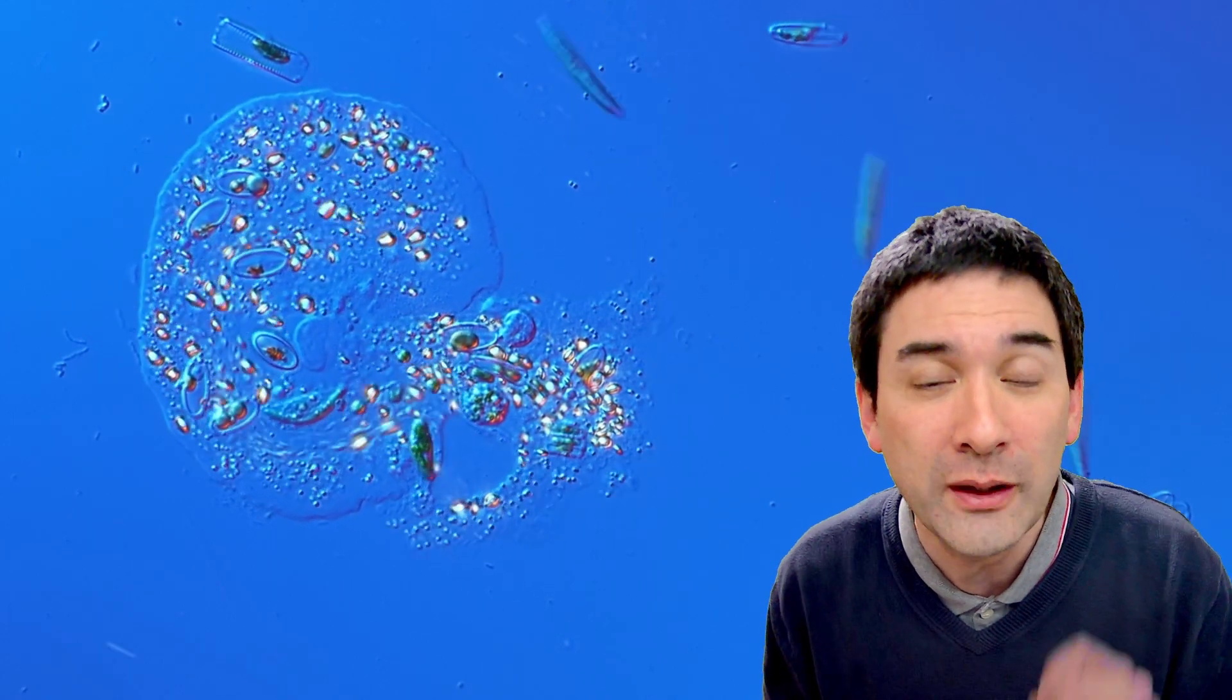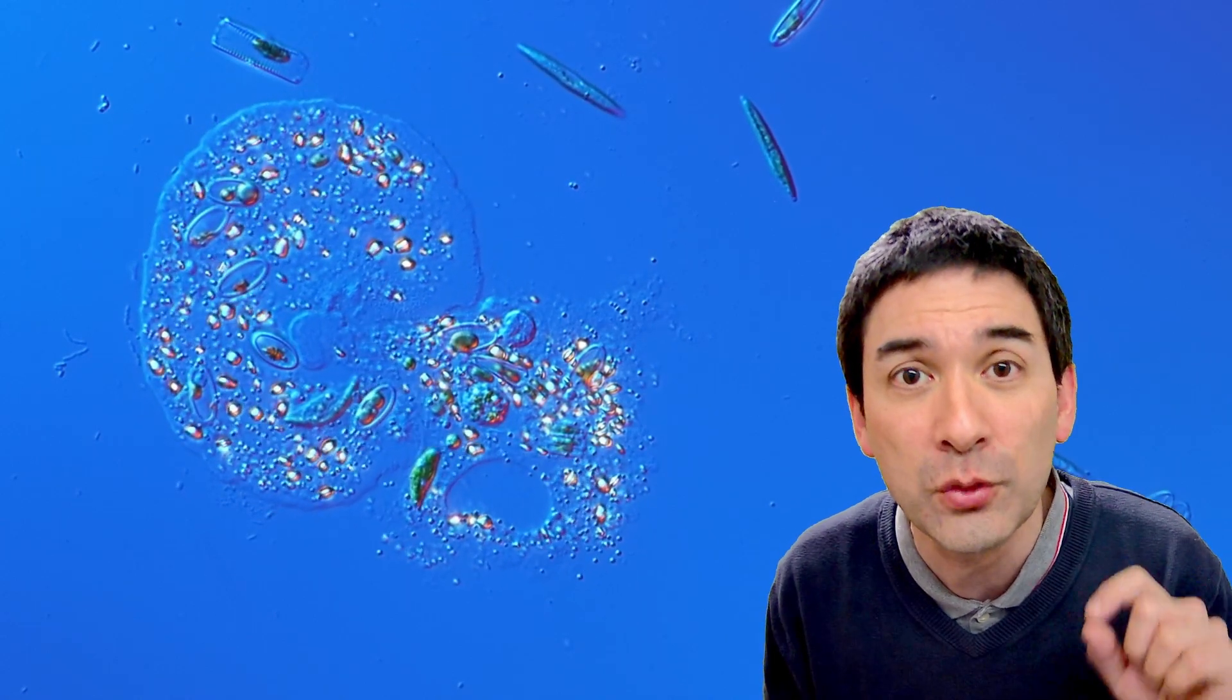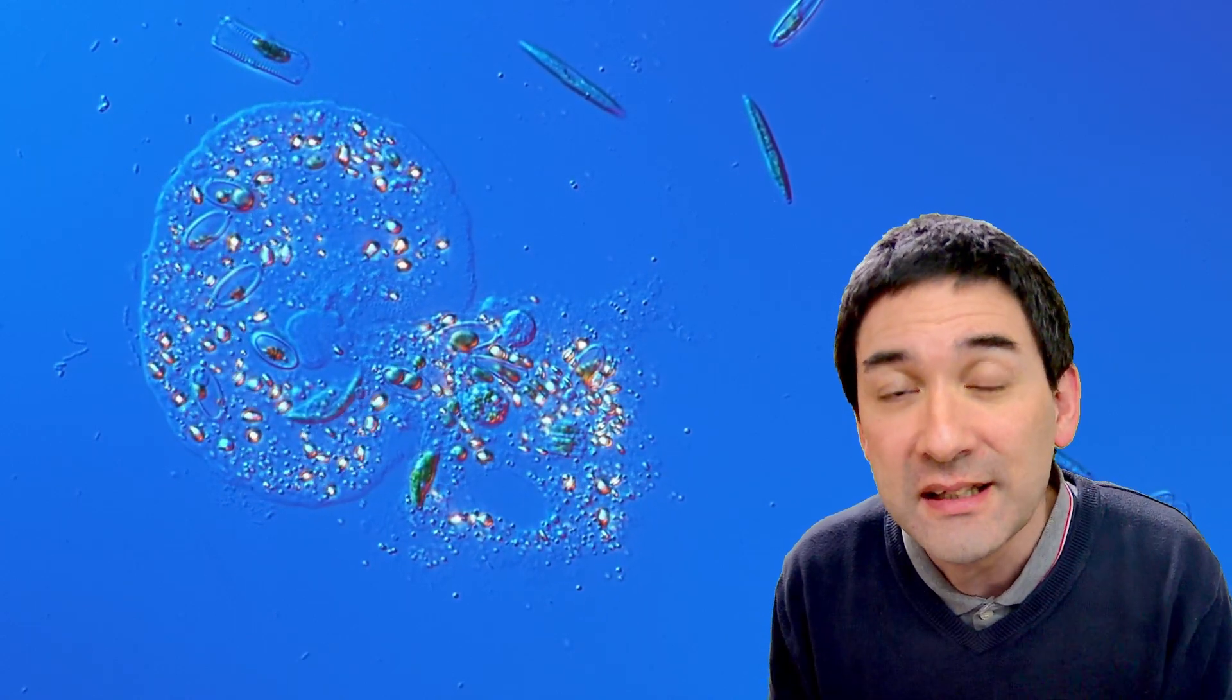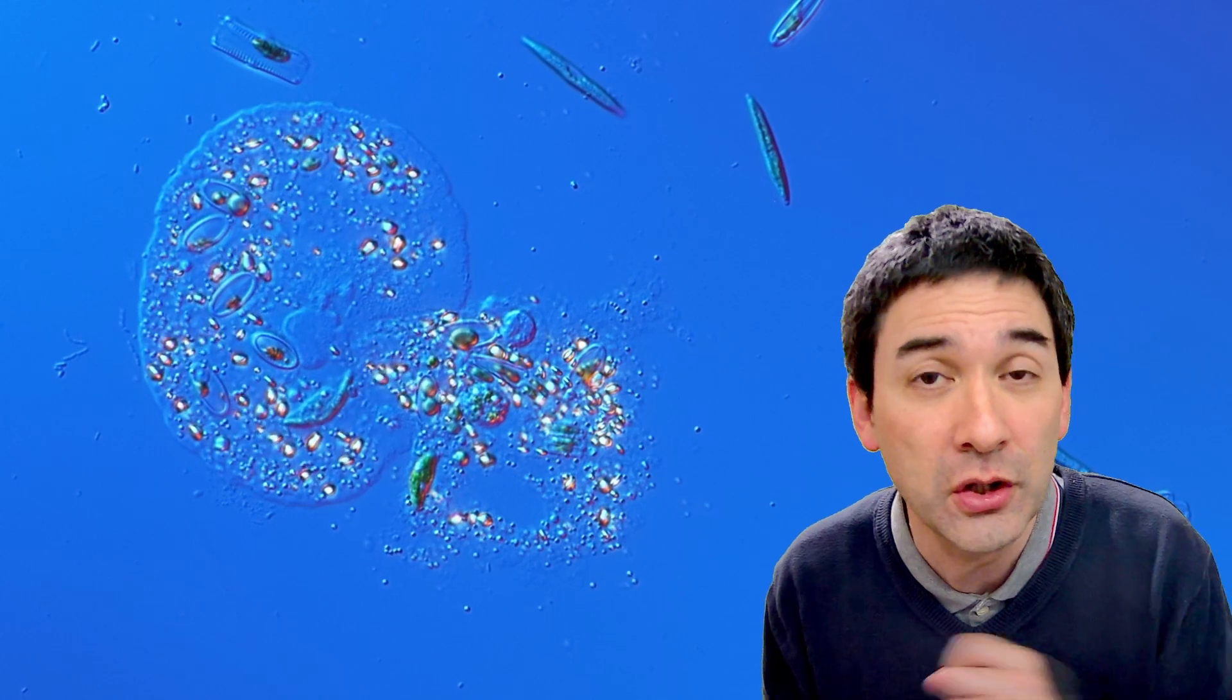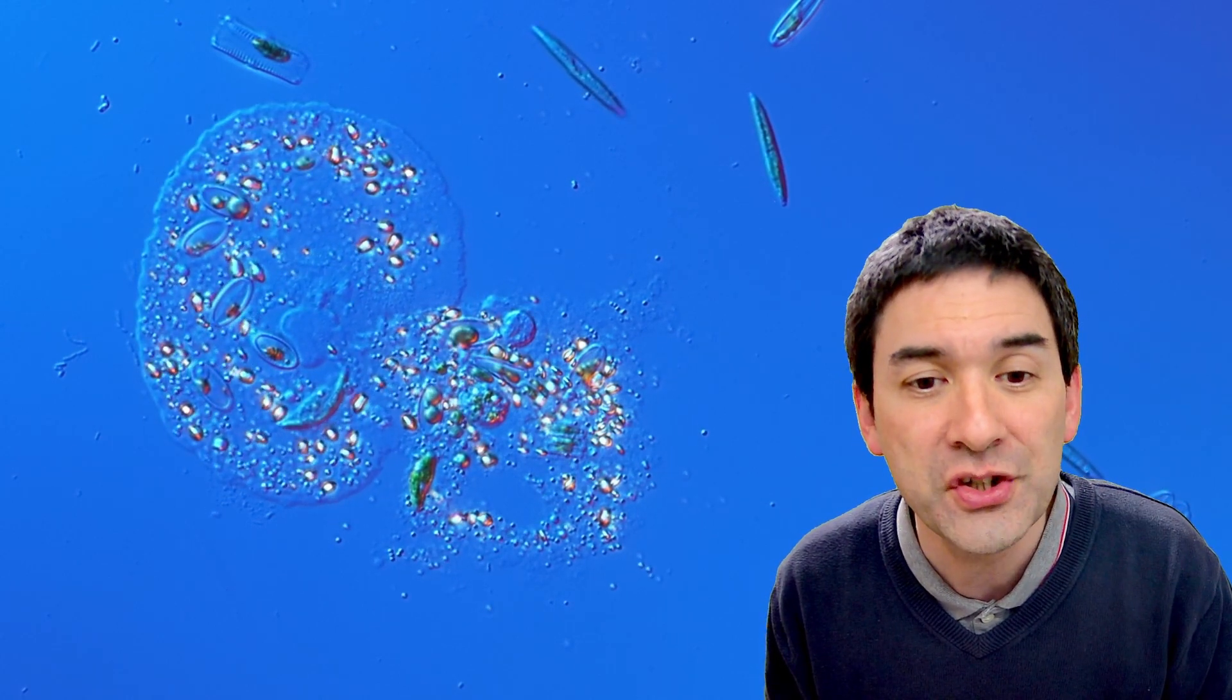What I'm going to do now is I'm going to quickly pause the video for a second because I want to show you a couple of the things that the amoeba has actually eaten, because there are a couple of interesting diatoms in there. So let me quickly pause here.